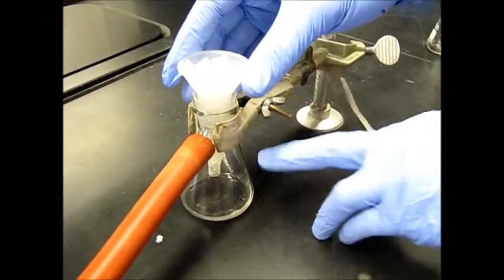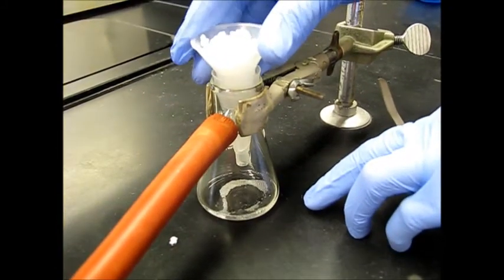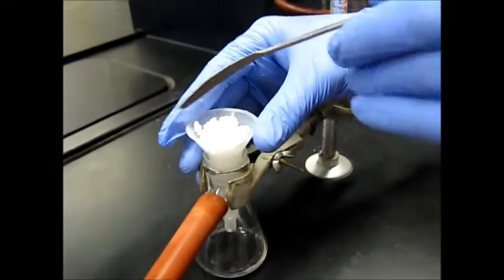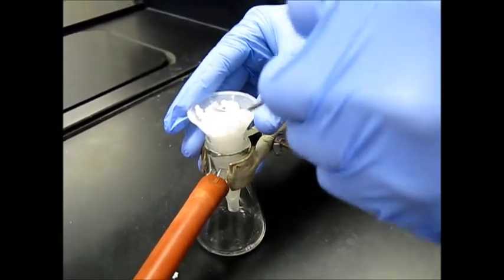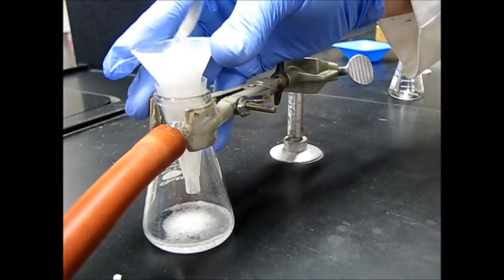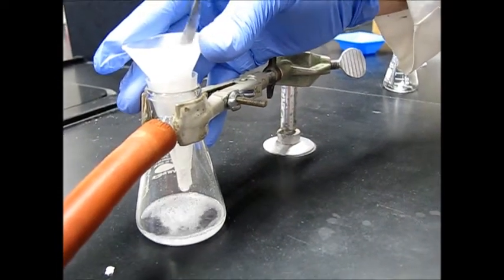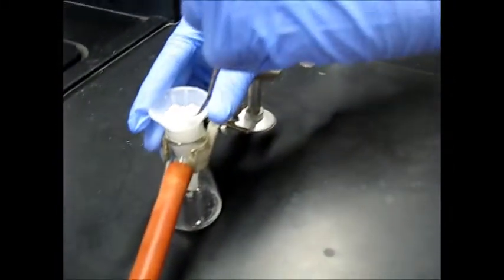If you push down, you'll notice that we actually get some liquid out. See there? That just helps the suction be a little bit stronger. We're going to let it suck dry for about 2-3 minutes. It helps if you press out the solid. See there, we get a nice... All that stuff is probably mostly HCl, a little bit of water, and maybe some ethanol as well. So we're going to want to make sure we press this dry.